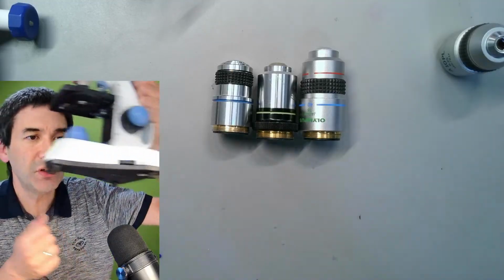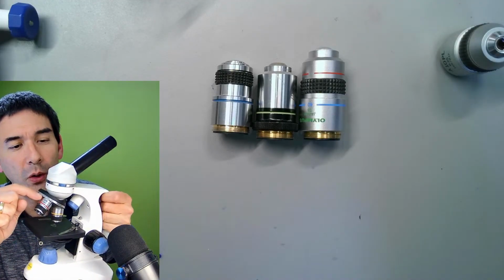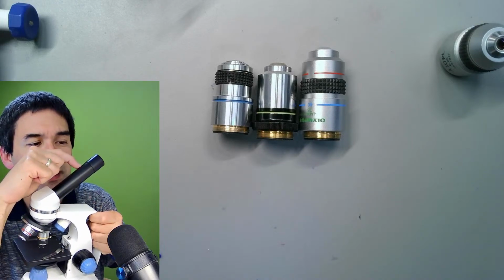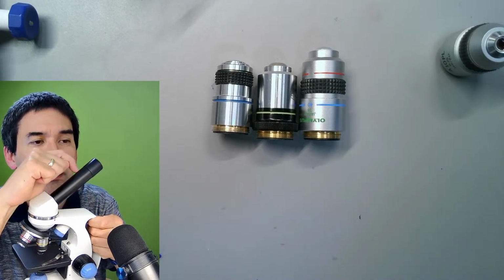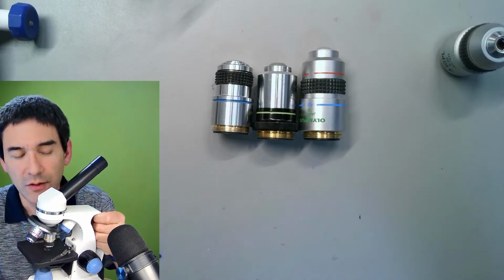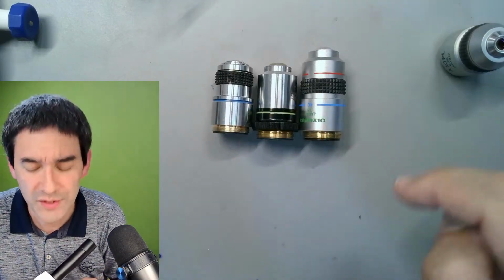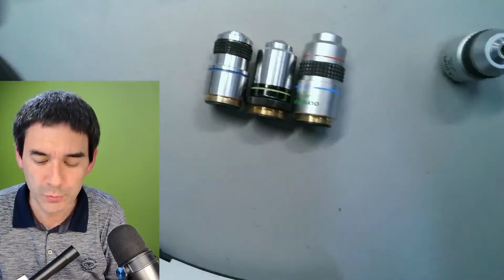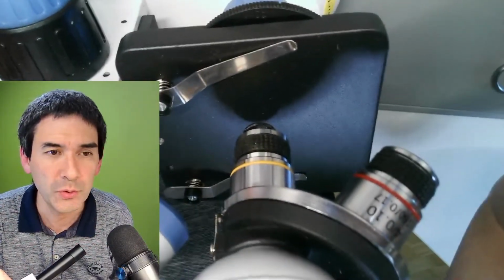Let me take this out here again. I'm going to hold it up here. 160 means that from here all the way to the place where it creates an image in here is 160 millimeters. So basically it creates an image and projects a so-called intermediate image in here. Yeah, it's 160 millimeters. The question that I have now is, because all of them have 160, is it possible to exchange them? I want to show this to you, and that's why you have to be a little bit careful when you buy exchangeable microscope objectives. Well, actually I can't, because I cannot flip it. Well, it's now upside down, but I hope you don't mind.